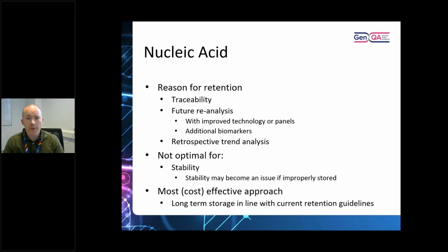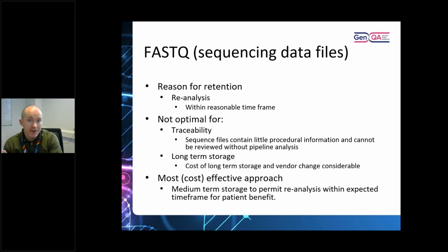So we go to the next slide. And then we get into the data side of things. The FASTQ, there's really only one reason you would keep a FASTQ, and that is if you want to reanalyze with a different pipeline in the future. So sometimes people might use a virtual panel. They might only look at a small subset of it, and they want to go back and look at it again. And so you might keep it for as long as it's useful clinically.